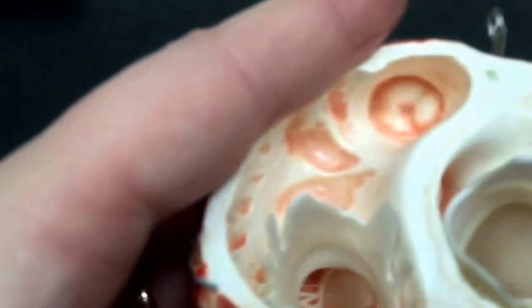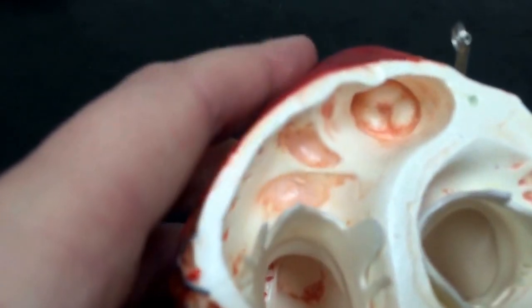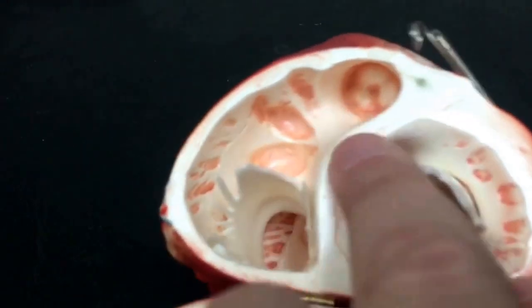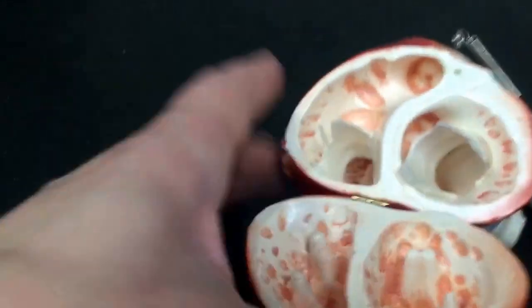You see there are three half-moon shaped cusps similar to that valve which was posterior to it, the aortic valve. If I lift up the leaflets of the mitral valve on that side, you can see that too. Not very well.